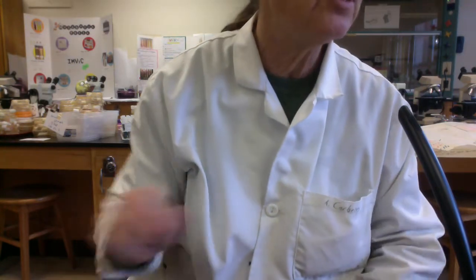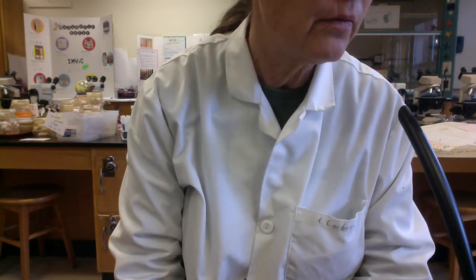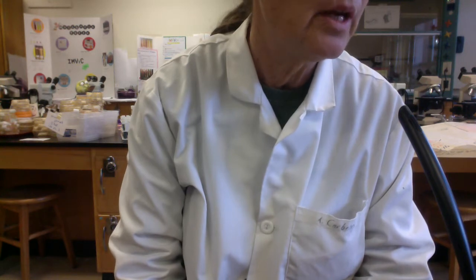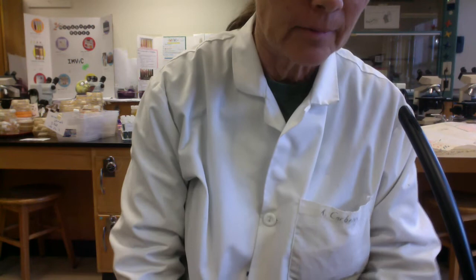We're also going to be using Sabouraud's dextrose medium, which is a selective medium. It selects for the growth of fungi. So we're expecting we'll grow both yeasts and molds on our Sabouraud's dextrose plates.